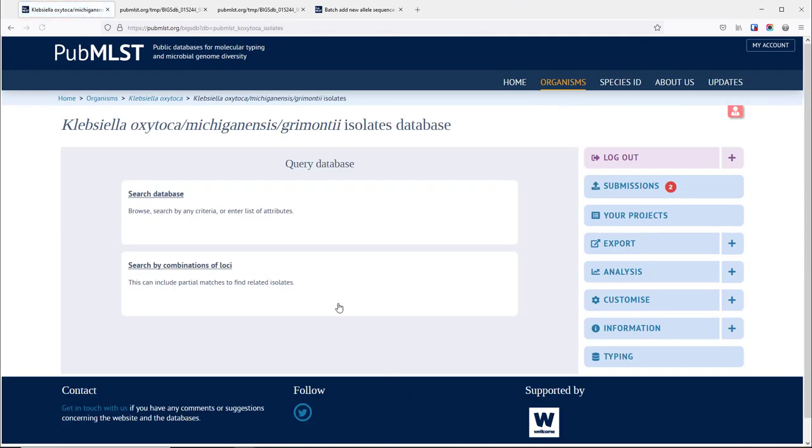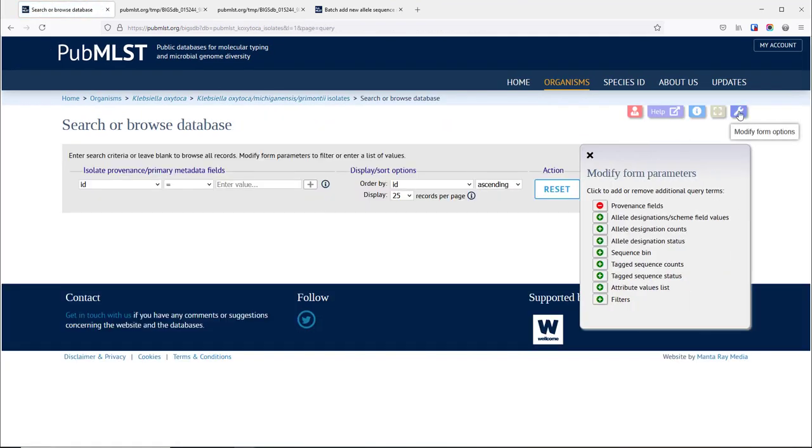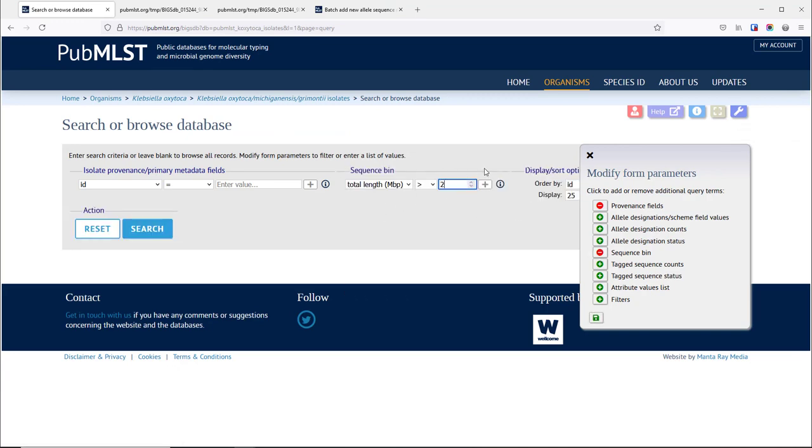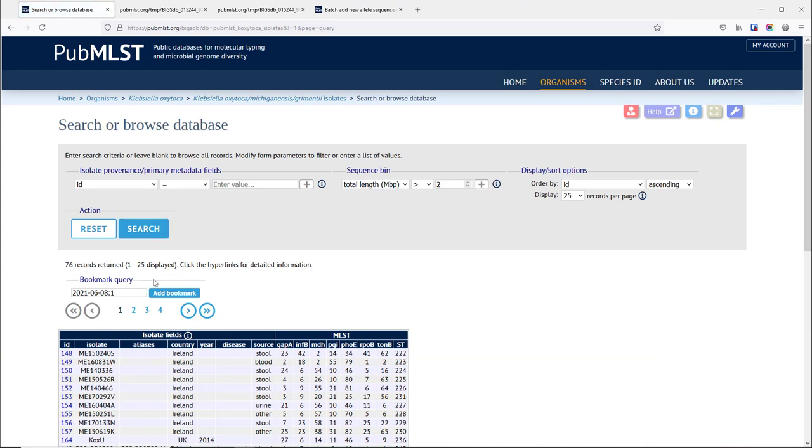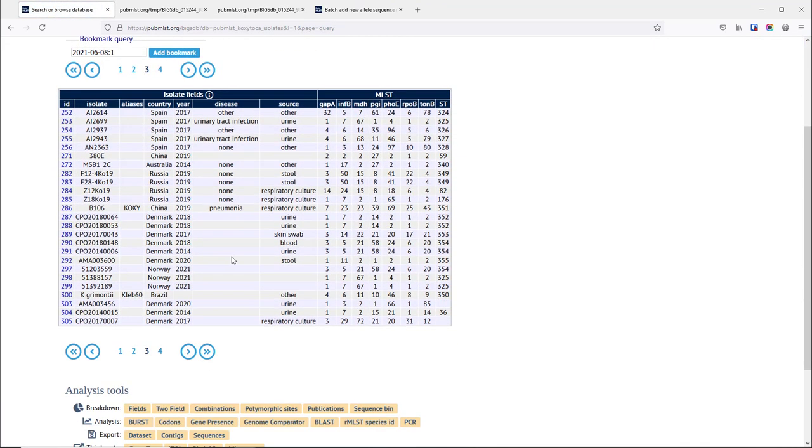Now if we go back and do a query to look at those isolates again within the database, repeat the query, and when we look at those records you will see now that those alleles have been filled in in the table and the only thing that's left to do now is to assign the new sequence type for that newly defined allelic profile.